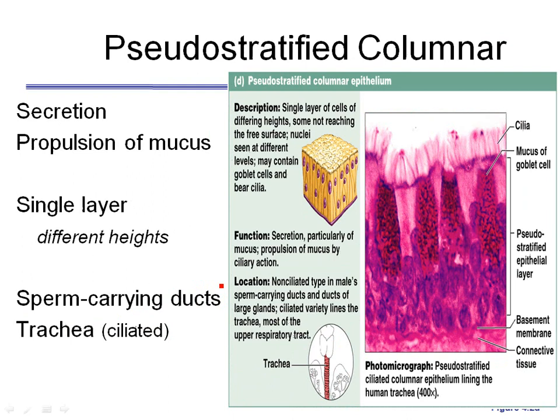And now, pseudostratified columnar epithelia. Again, we go to where the basement membrane is, right down here. And then count nuclei all the way to the apical surface. Well, if you do that, it looks like there's 5 or 6 layers of nuclei here, so 5 or 6 layers of cells. However, in reality, the cells are different heights, and every cell is in contact with the basement membrane for the most part. So that means it's really one layer, but it looked like it was 2.